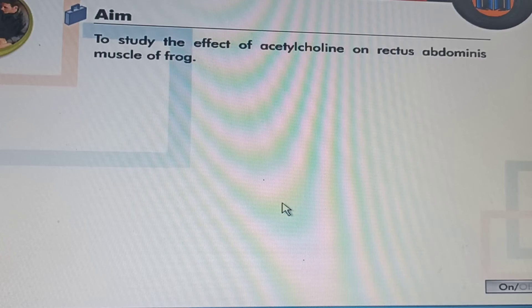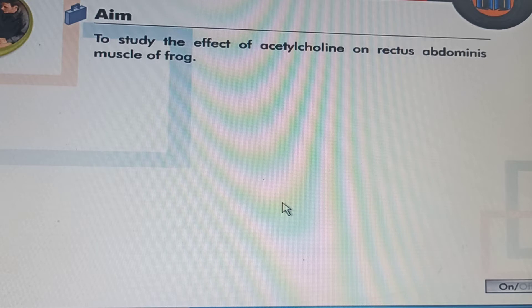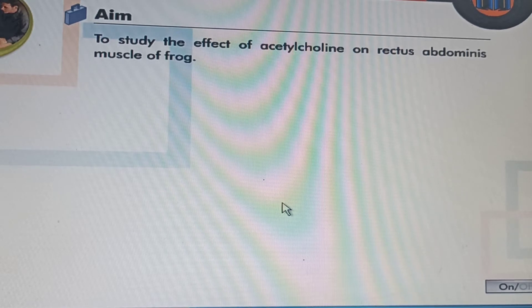Hello dear students. The title of this experiment is to interpret from the graph by observing the effect of acetylcholine on isolated rectus abdominis muscle of a frog. So let's start our experiment.